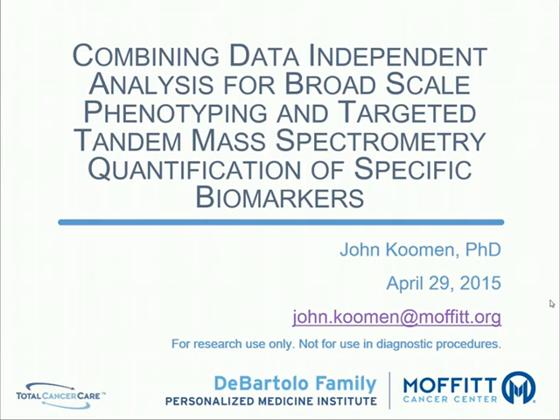I appreciate the opportunity to speak today, and what I want to talk about is the use of some of the cutting-edge mass spectrometry equipment for integrating multiple scan types to evaluate questions in cancer biology. So the title of this talk, again, is Combining Data-Independent Analysis for Broad-Scale Phenotyping with Specific Targeted Tandem Mass Spectrometry Quantification of Biomarkers or Target Proteins of Biological or Clinical Interest.